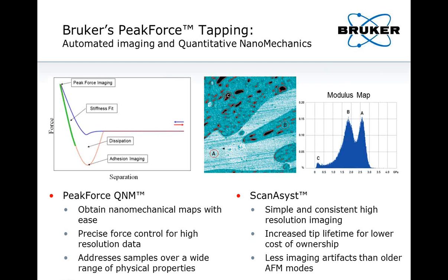I already mentioned PeakForce Tapping. What is PeakForce Tapping? PeakForce Tapping basically uses the most basic operation of an AFM, and that is simply moving the tip up and down. And we call that executing a force curve. What happens during a force curve is shown on the top left diagram. Let's move the tip towards the surface as indicated by the blue arrow, and the curve basically shows here the deflection of that cantilever.